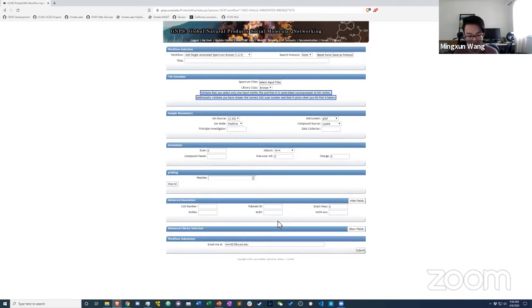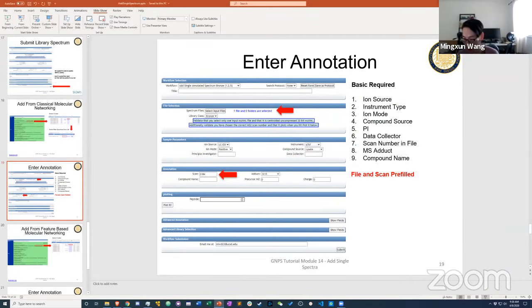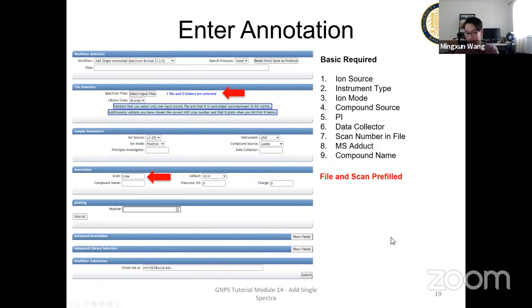And for those of you familiar with ChemDraw or tools like that, you should be able to export a drawn structure as IUPAC, as well as being able to export it as SMILES or InChI. I personally don't know how to draw structures, but I think almost everybody else here in this chat does. So definitely ask somebody who's actually a chemist. But okay, so again, that's one way to pre-fill it.